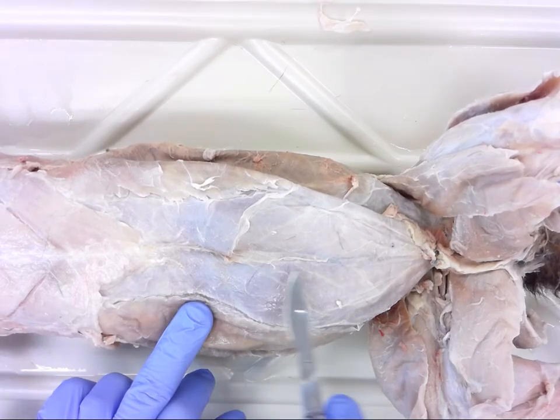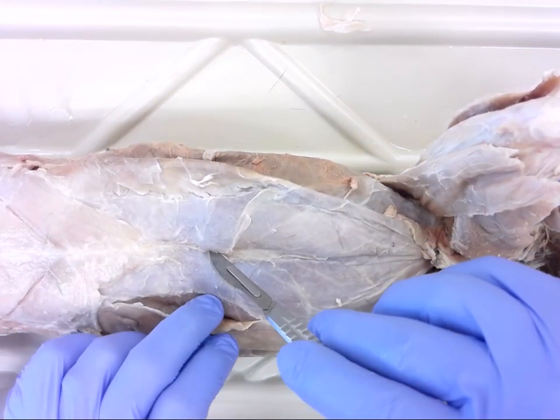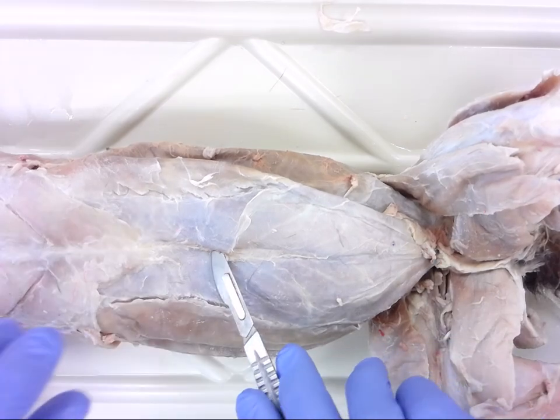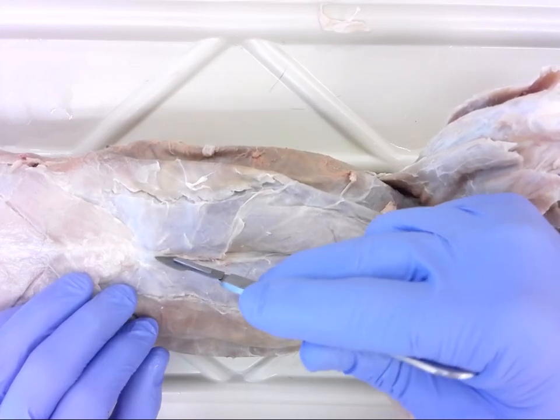It runs right down the middle. And if you remember from an earlier video, my skinning video, you saw that I actually got a little deep. So I'm going to find that spot, which is right there. And I'm just going to take my scalpel and lift lightly along the linea alba.